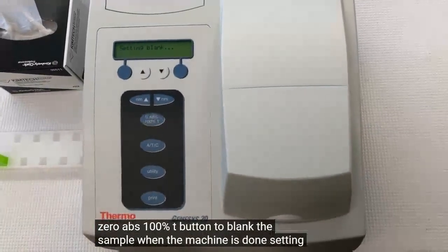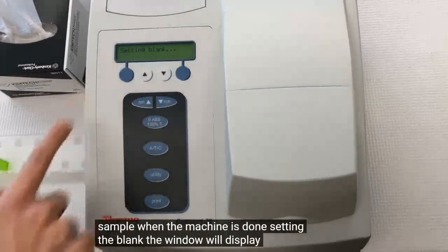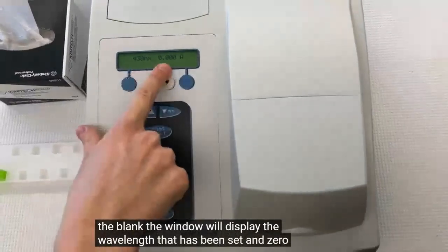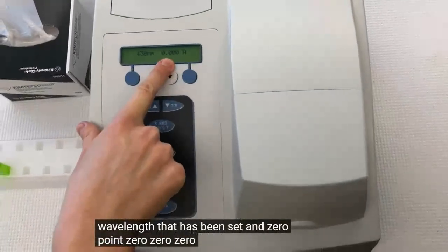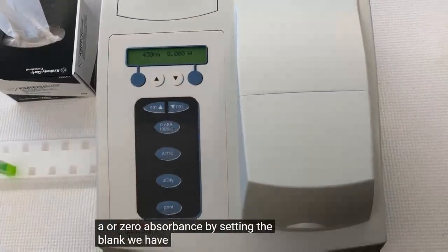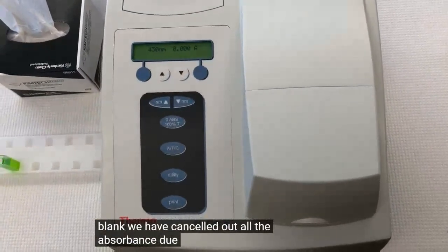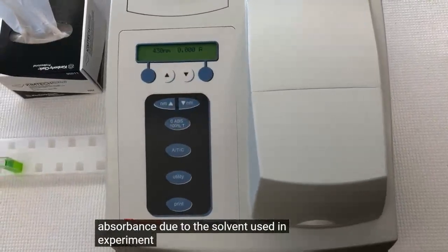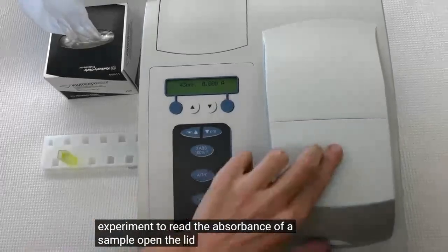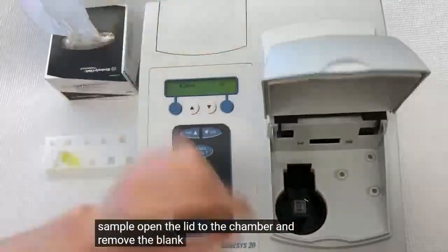When the machine is done setting the blank, the window will display the wavelength that has been set and 0.000A, or zero absorbance. By setting the blank, we have canceled out all the absorbance due to the solvent used in the experiment. To read the absorbance of a sample, open the lid to the chamber and remove the blank cuvette.